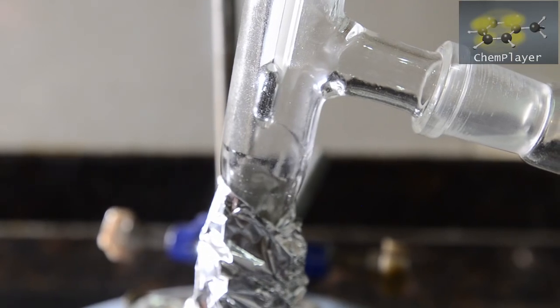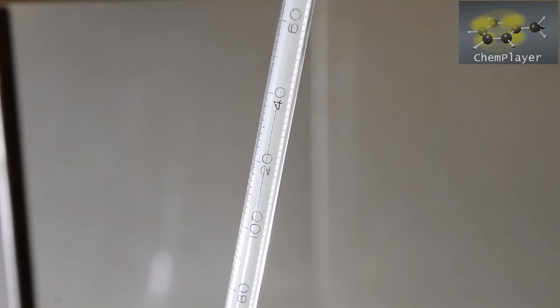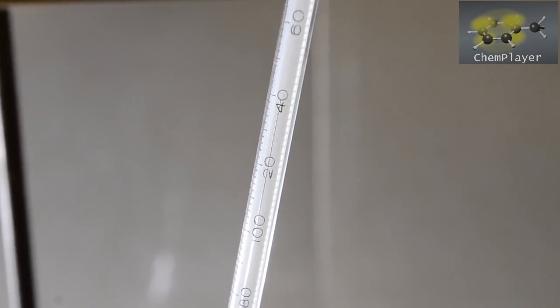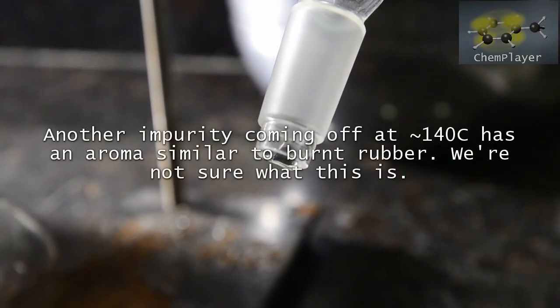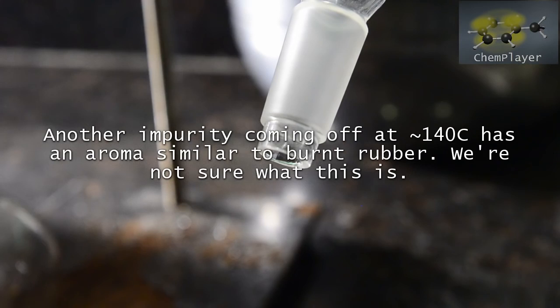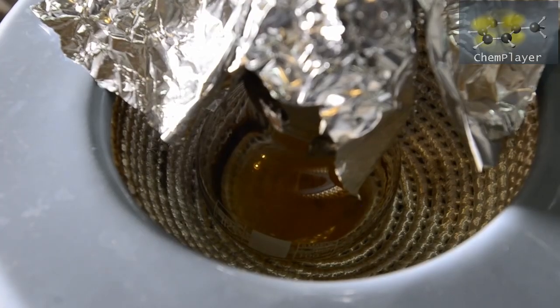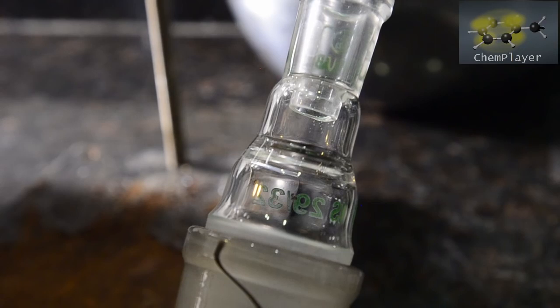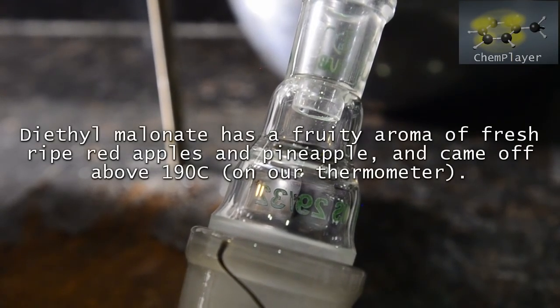Then the temperature increases and we start to get a main liquid vapor front coming up the glass. The temperature shoots up to about 140 degrees C and we get a few mL of a rather unpleasant smelling liquid coming over. Then the temperature increases again and we get distillation of a clear, fruity, sweet smelling liquid at above 190 degrees C. This is our pure diethylmalonate distilling.